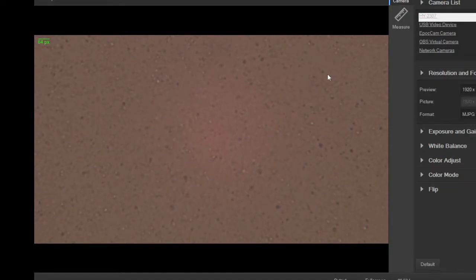And they're kind of wiggling because, oh, I know why. This camera's stuck, I think. Let's see, why is the camera stuck? There we go. That's what I wanted to see.